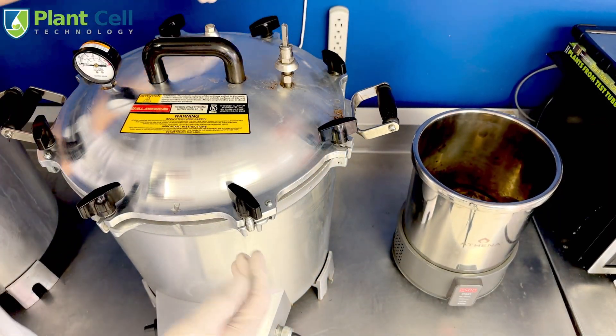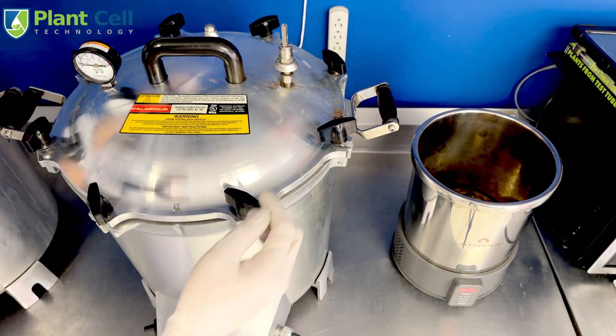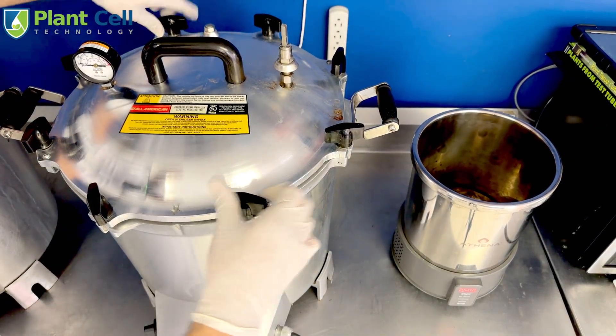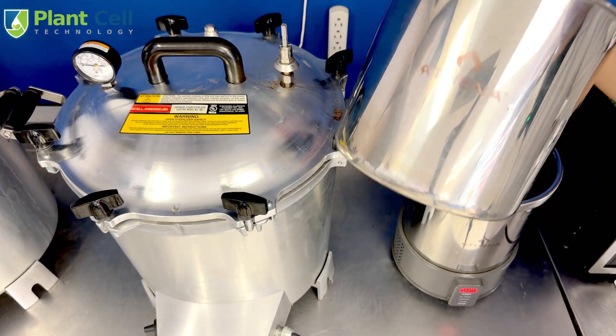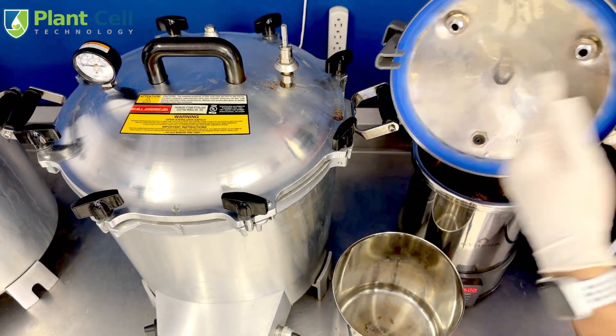Now I'm closing the sterilizer. Using all the knobs to close it, you want to do it like a car wheel — you don't go in order, you want to do opposite ends to make sure it closes evenly. This ensures the lid has been evenly closed.